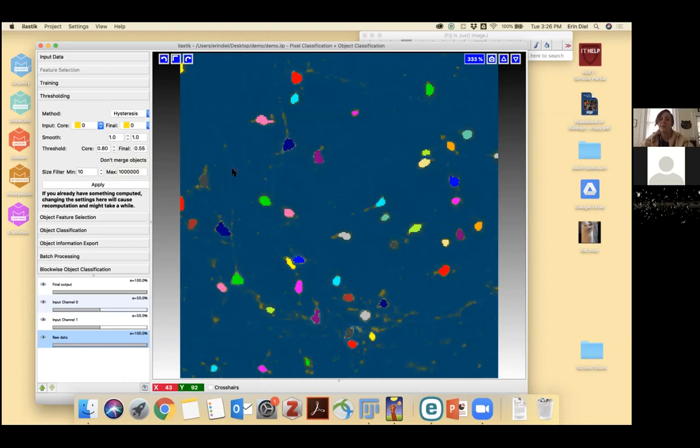And so you could imagine that if you had 2 nearby cells, maybe the center of those cells is where it's most confident that it's found a positive pixel. And so it would set the seeds there, but you would still have, say, 2 seeds, one here and one here, and then it would still allow them to grow out with that second threshold to find the entirety of the cell body. But in the case of this image, the simple threshold works fine.